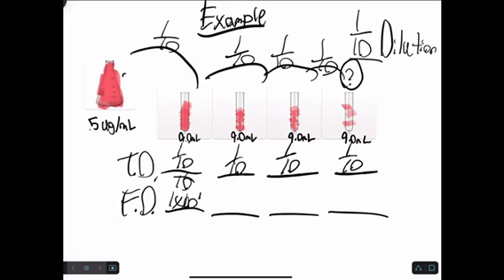So it's just 1/10. Our second one, or it would be this, our negative exponent. And our second would be 1 times 10 to the second, which is 1/100. Our third, because we're taking 10 times 10, it's equal to 100, and we're doing that for our third one, and that is 1/1000. And our fourth one, which is 1/10,000. This is the easiest way of doing serial dilutions.